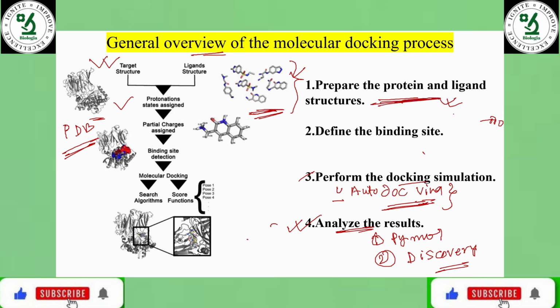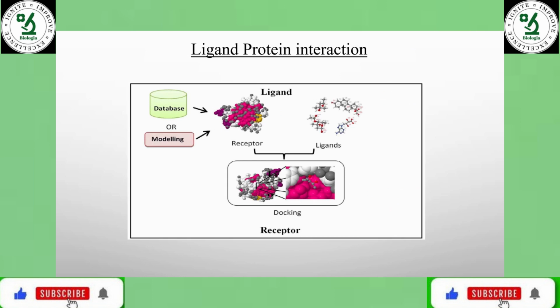So this is all about ligand-protein interaction, that is, molecular docking of ligand and protein. Protein-protein interaction I will discuss later.